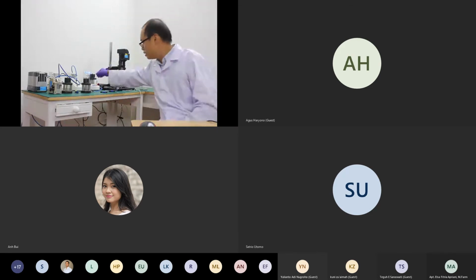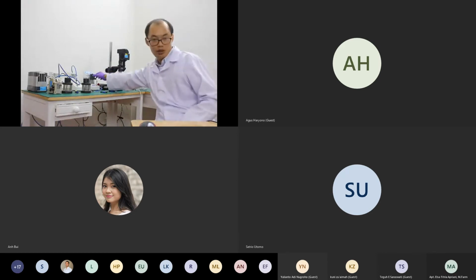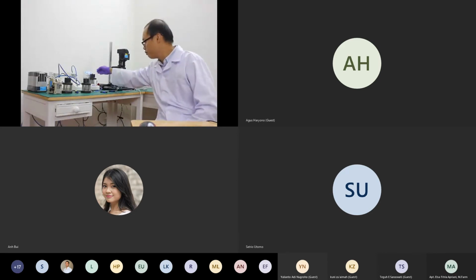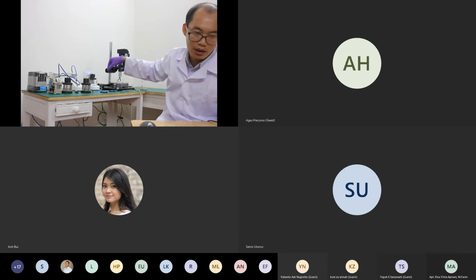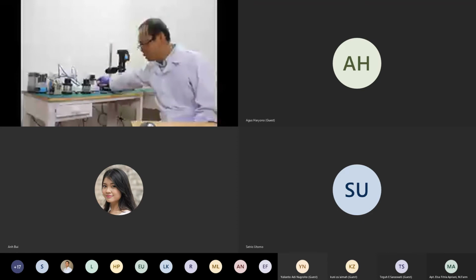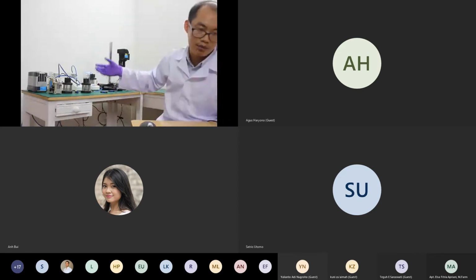The other is the advanced pump, which has a knob control on each pump, so we can control the pressure or flow rates by both functions, from the pump knob and from the software as well.